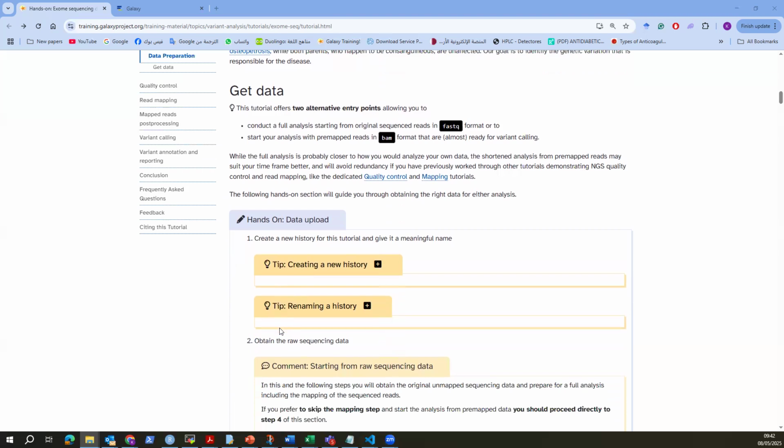In order to know where each of these short reads belongs, we need to map them to the reference.